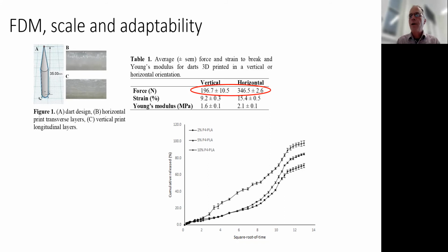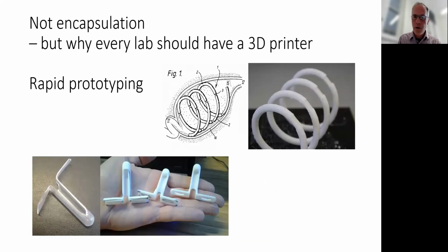I'll just finish up now with some comments on why I think every laboratory should have a 3D printer for many, many applications. Never underestimate the ability to rapid prototype. If your lab doesn't have a 3D printer, just a home hobby one for a few $100s, you're missing out on a lot. Find somebody in your lab who's young and can Minecraft, and they can have this up and running for you in a day. You can then maybe find something in the literature that you think is worth investigating, and it's just an idea somebody published 20 years ago.